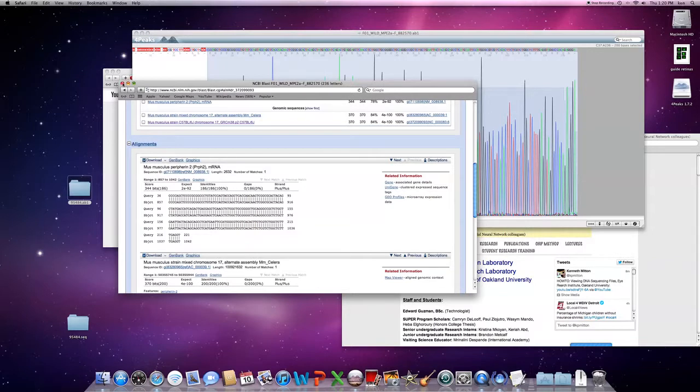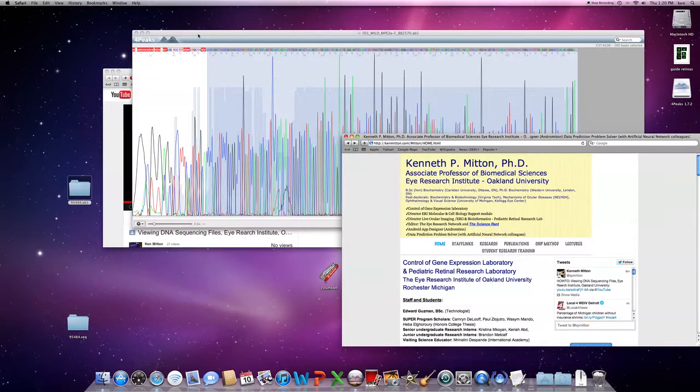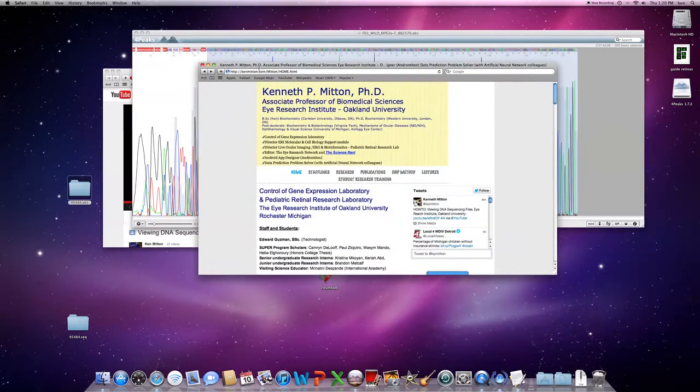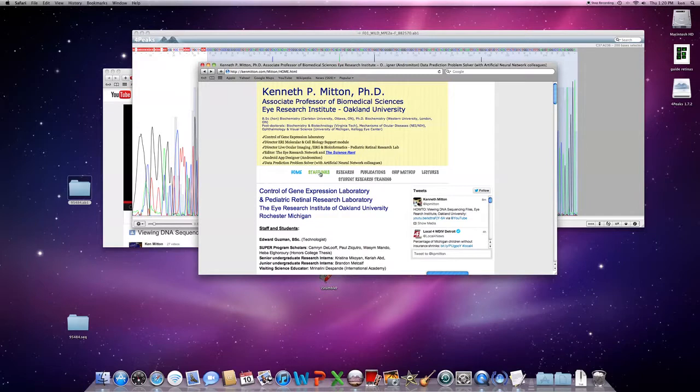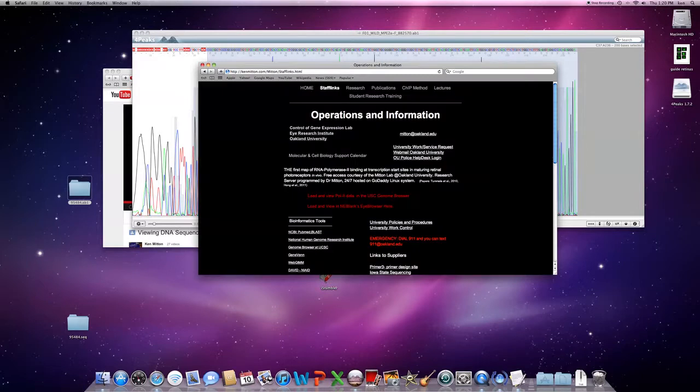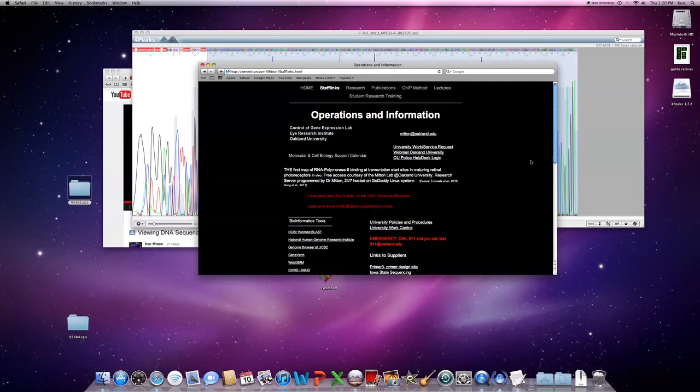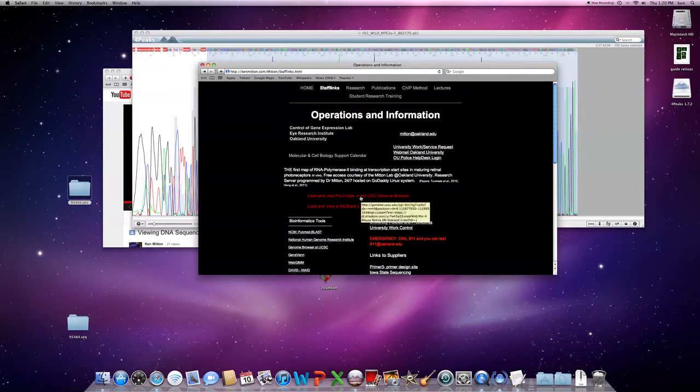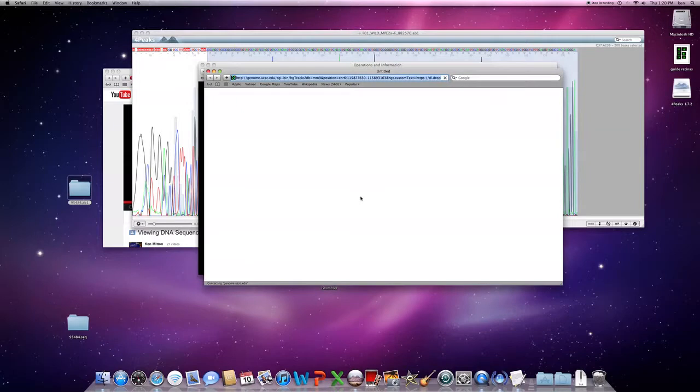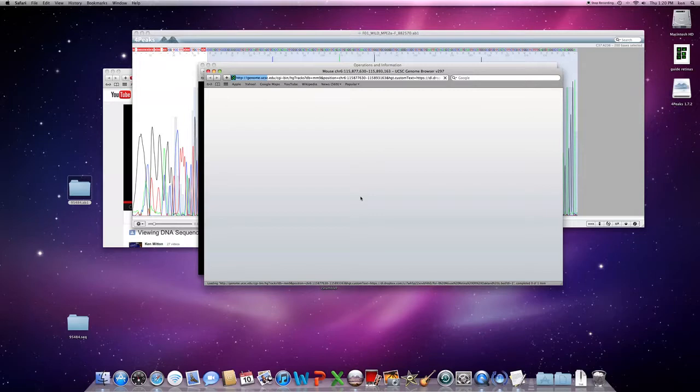The other thing you can do is take that sequence yourself, just copy it. You go to my website KenMitton.com, go to my staff links page. There's a quick viewer here you can call up. You can go right to the NCBI PubMed Blast tools. You can also use my polymerase 2 data which we provide free for other scientists in the world, loaded up in the University of California Santa Cruz genome browser. Let this launch for a few seconds.